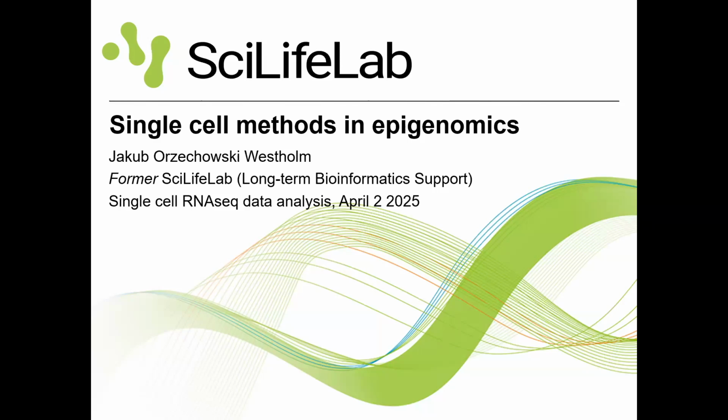But I guess with some data sets, a lot of benchmarking could be done with the different predictors of doublets, right? Yeah. That we have seen through the lectures. And of course, I guess you have talked about the methods to detect doublets for RNA-seq data, right? DoubletFinder and these ones. And for ATAC-seq, there are some other methods too that I don't remember the details of, but there are specific methods that make use of the ATAC-seq data in a better way.